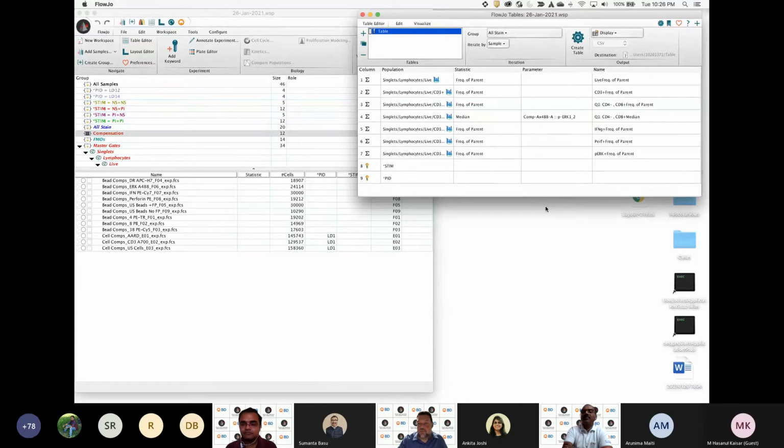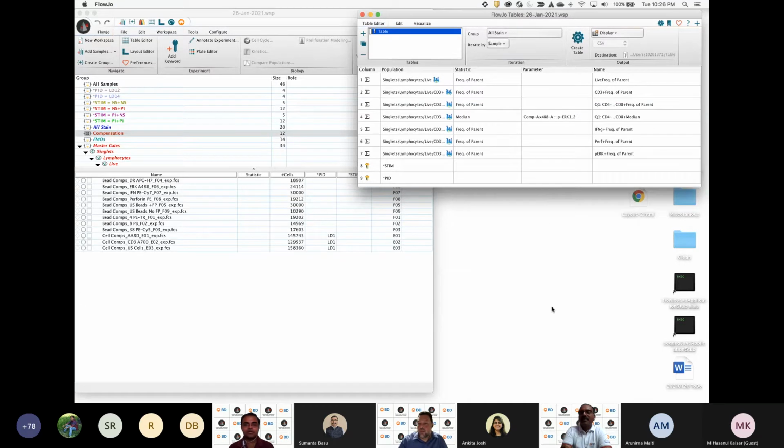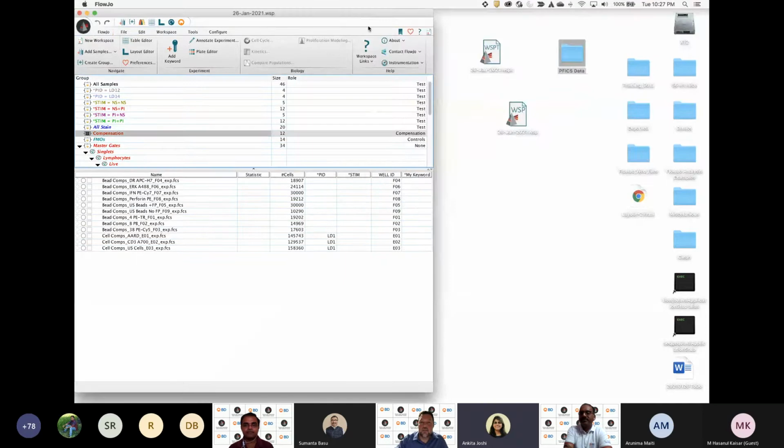Excellent. Okay, we can go to the next question, I guess. Ankita, next question. Yes, sir, it's live now. The next question, Amlan.